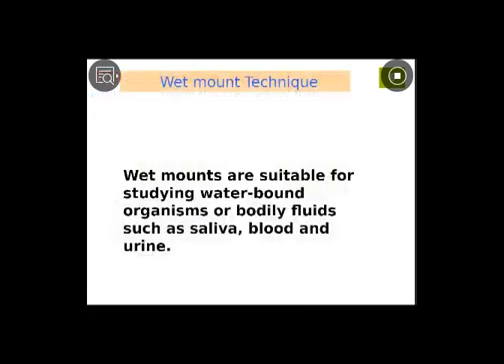Wet mount yani ayna bil moya, we usually use to make slides when we are dealing with any liquid. For example, saliva, blood, urine. Saliva yani loab, blood yani dam, urine yani bol. So if we make these types of slides, we make wet mount. Wet mount yani ayna bil moya.